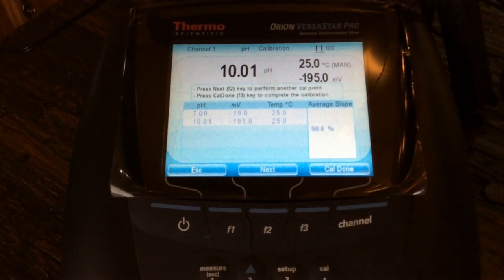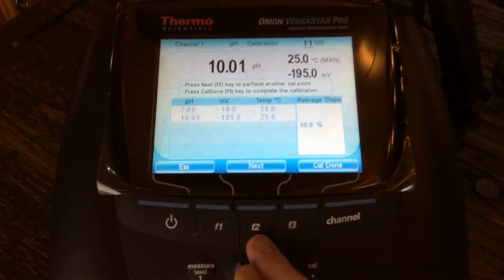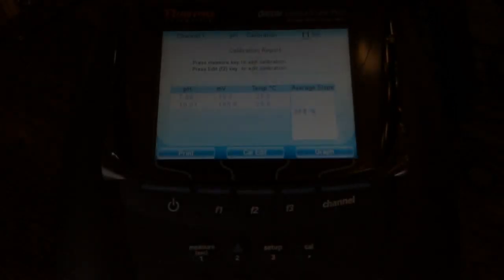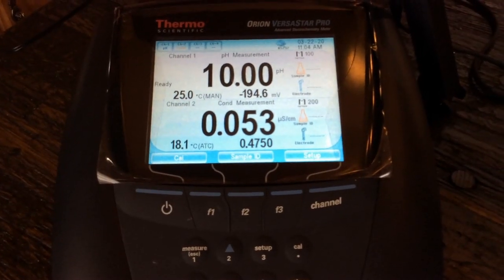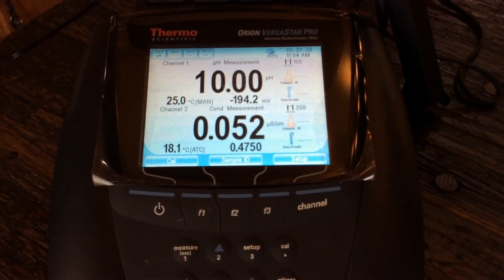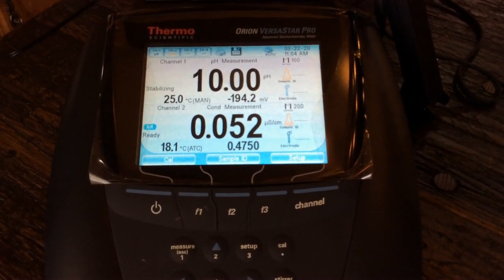Now if we wanted to perform a three-point calibration, we could do that by hitting next — F2. But we're going to be done here, so I'm going to go ahead and say cal done. Once we're done at any point, you can just hit measure escape and we can escape back to our home screen, where we can see both conductivity and pH — channel one conductivity, channel two.